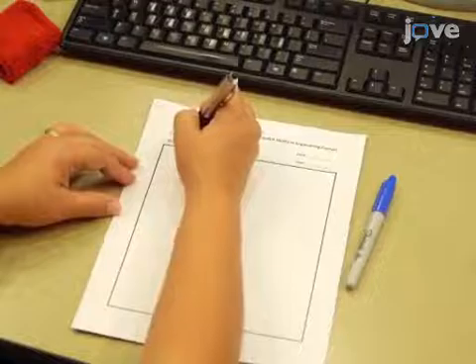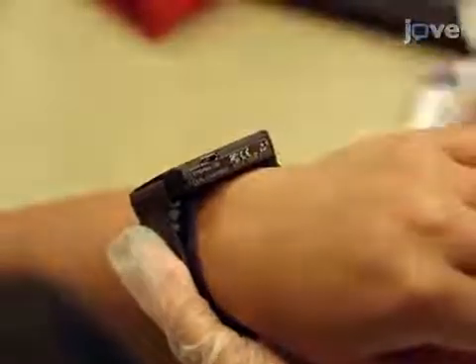To begin, make a record of the participant's study ID code and the unique wrist sensor barcode provided by the supplier.